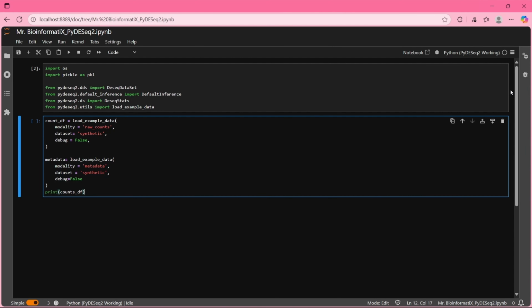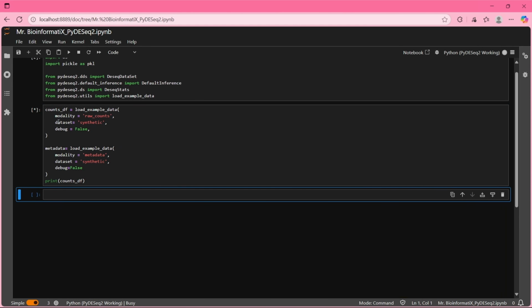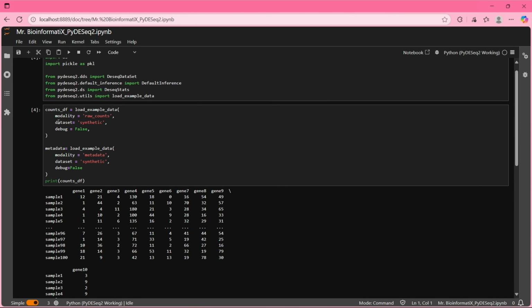Let's run our code. And here we have it.